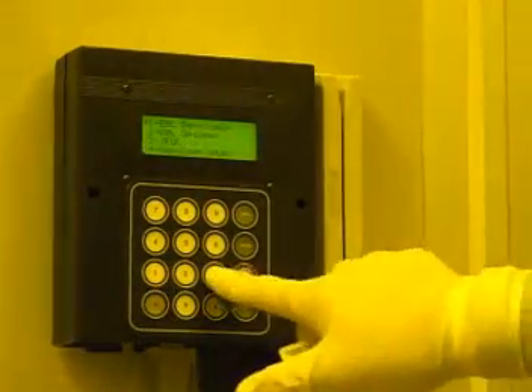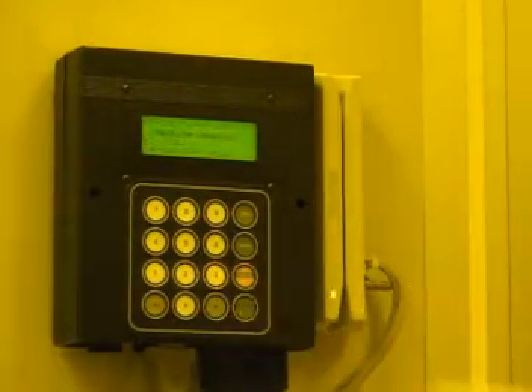To begin using the JBX9300, you must first log into the system at the access controller, which is located at the entrance of the processing area.